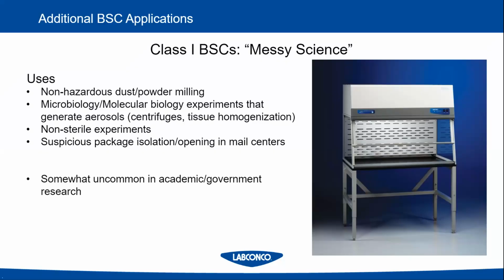Class 1 biosafety cabinets are also used in mail centers for opening suspicious packages. They contain whatever is on the inside, but we don't necessarily care about having a sterile environment. These are somewhat uncommon in academic and government research labs, because most of the things done in the Class 1 biosafety cabinet can be done in a fume hood, with the exception of biohazards. So if there's a true biohazard, it should be done in the Class 1 biosafety cabinet.